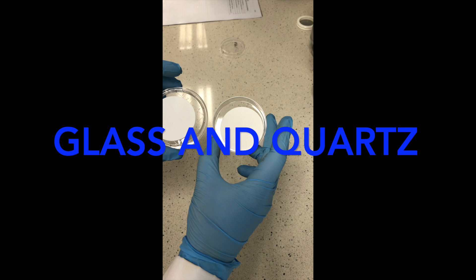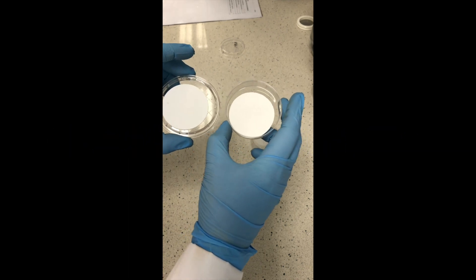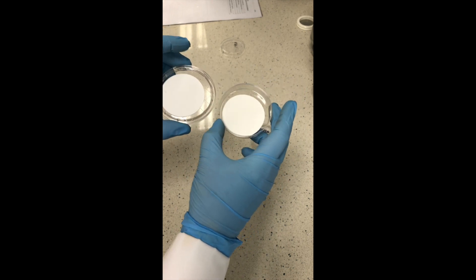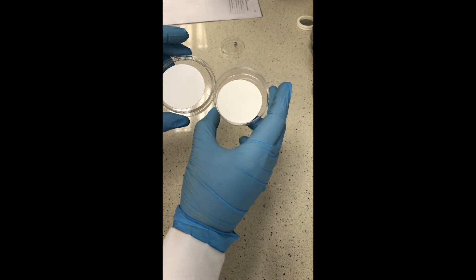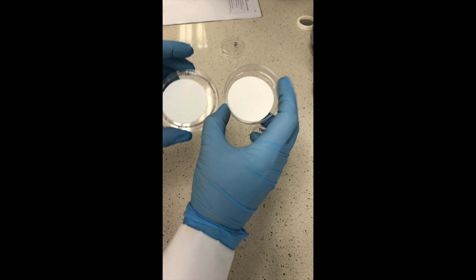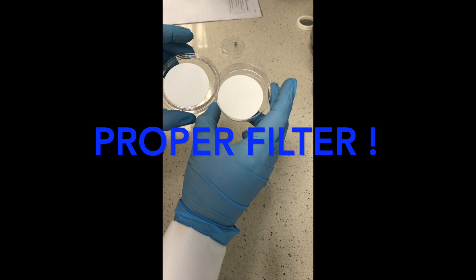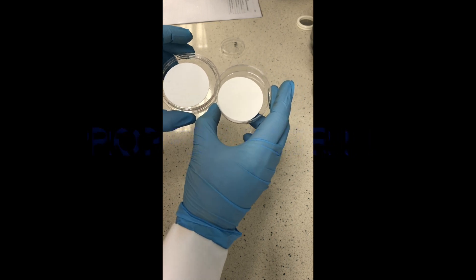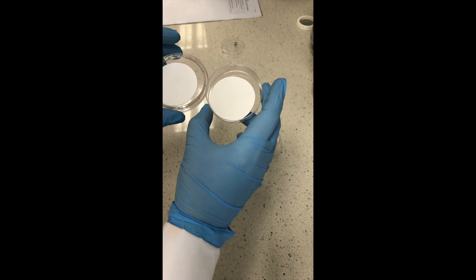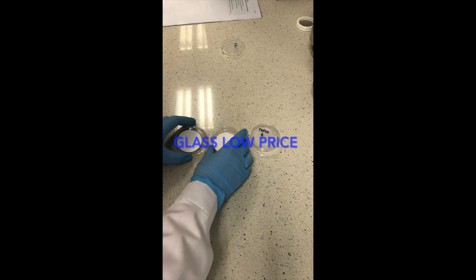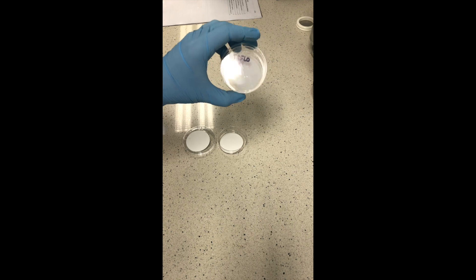And those two are glass and quartz filters. On the first look, you don't see the difference. But if you want to determine the concentration, not only dust, but also the content on the dust, for example heavy metals, you need to use the proper filter. If you want to make more determinations of other contaminants, you'll need quartz filter because quartz is cleaner than glass. Of course, the difference is also in price. The glass filter is the cheapest and the highest price is for the Teflon filters.